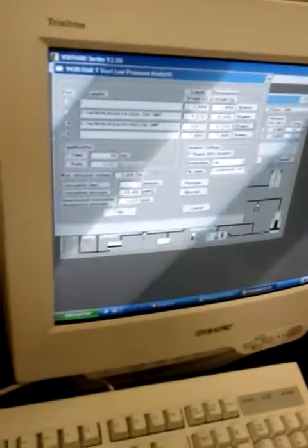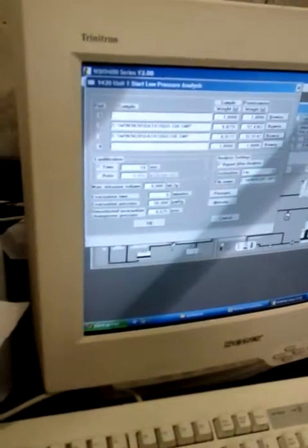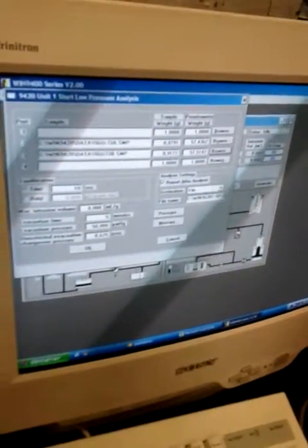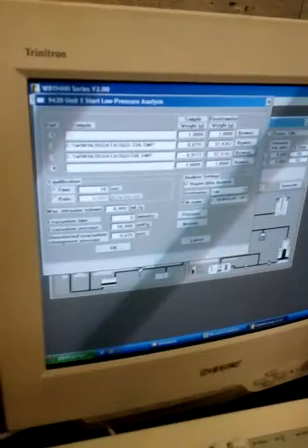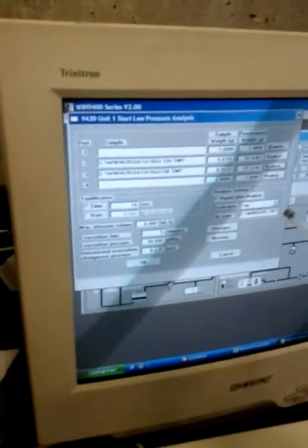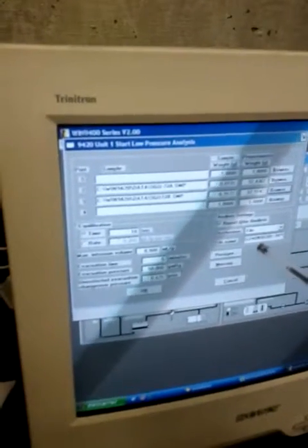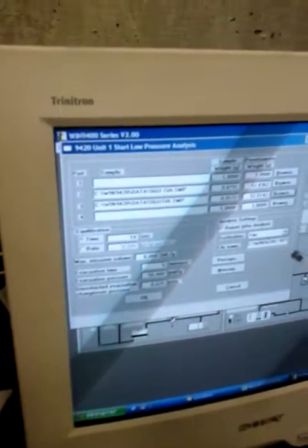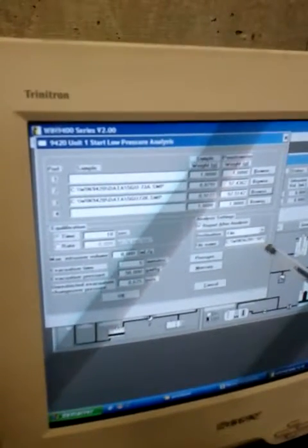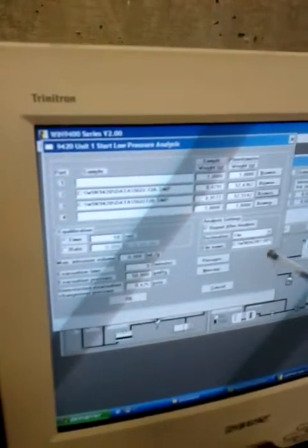After that we have to go in analysis setting, just check where it is. Here there is a little mistake. It's not in win, there is no data. It's directly in point slash. So the report name will be in this file, and it will be the name of the sample with .RPT, like report.